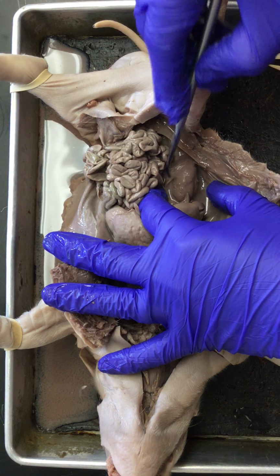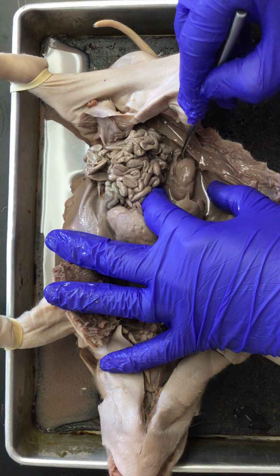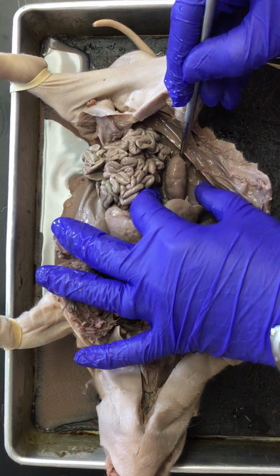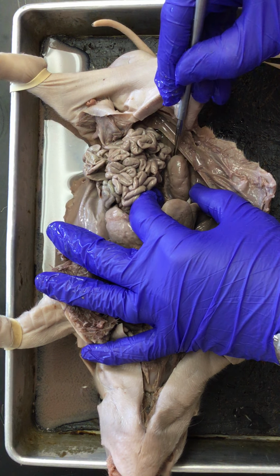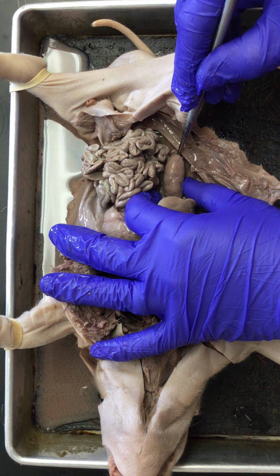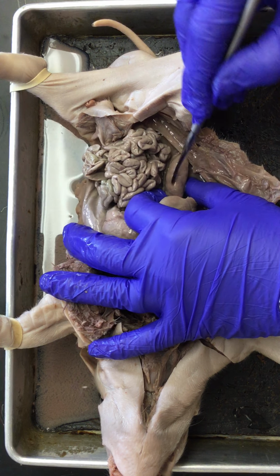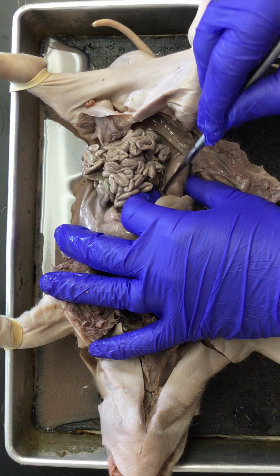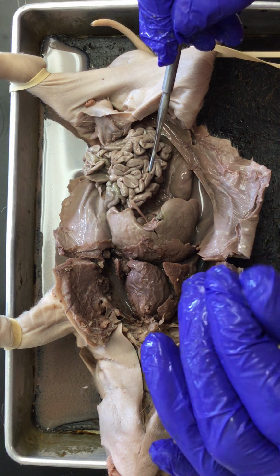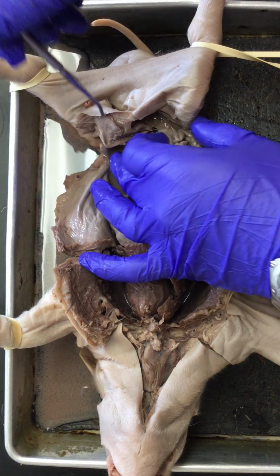So now you get a good look at the kidney. Kidney also a filtering organ. Kidneys filter the fluid that comes into your body. Yeah, there we go. Nice look at the kidney. Any fluid that gets filtered out by the kidneys gets processed and put back into your system. Anything that is meant to be excreted, any waste, kidneys will connect to your bladder. Bladder connects to your urethra, and then you pee out your urethra. So here's a kidney, another pretty hyper-filtrated organ. Very much like the liver, the kidney would feel pretty gritty as I rub it in between my fingers, just because of all of the different nephrons and filters, basically, that are inside the kidney.